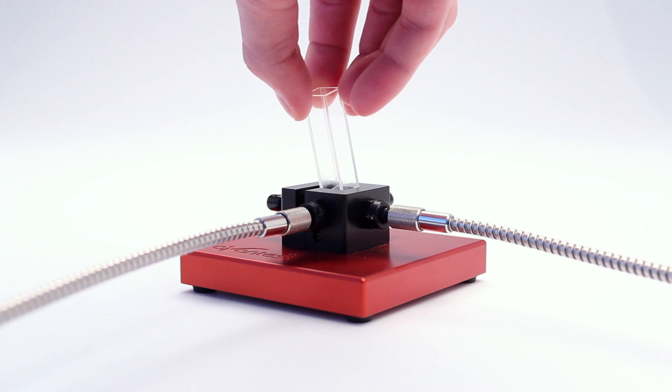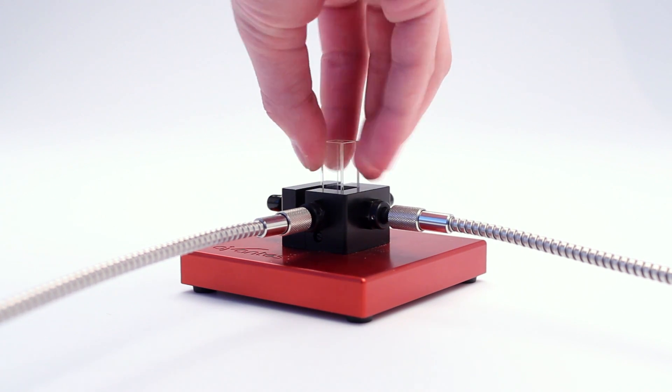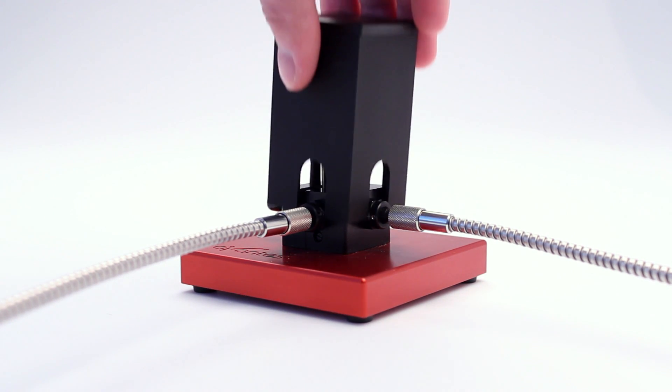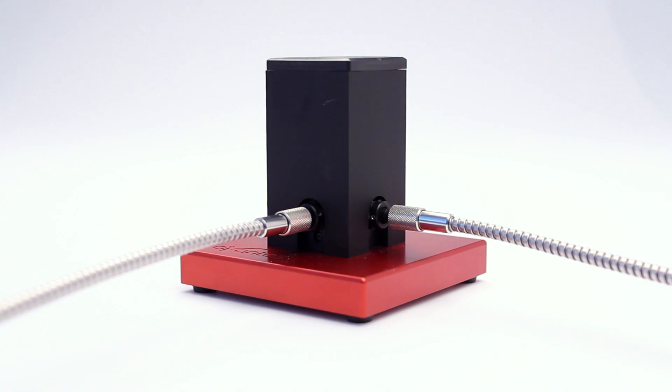Put the empty cuvette in the cuvette holder and place the black cap. For a better result, we recommend our special fluorescence cuvette holder.